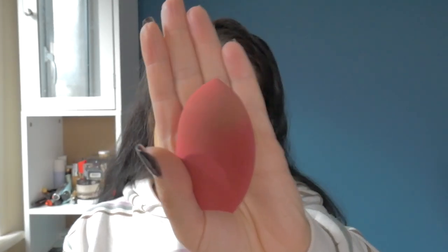So the first thing we're going to look at is a makeup sponge. This is a dry makeup sponge — I've got a couple here. This one's very dry and this one's a bit more squidgy. Both, as you can see, very dirty. Both in need of a clean. So the first thing we're looking at is a Morphe sponge — a very dirty Morphe sponge. I don't think I want to get any closer.